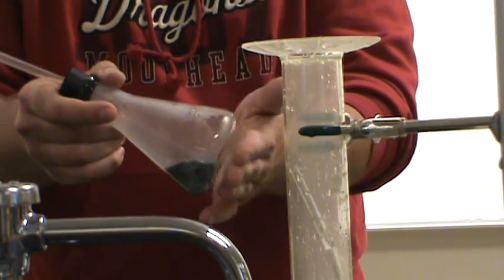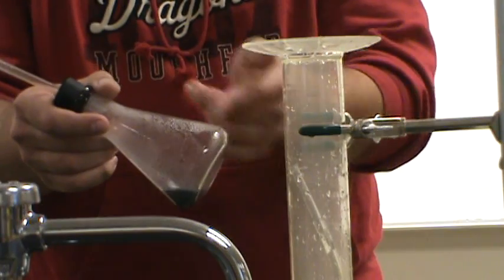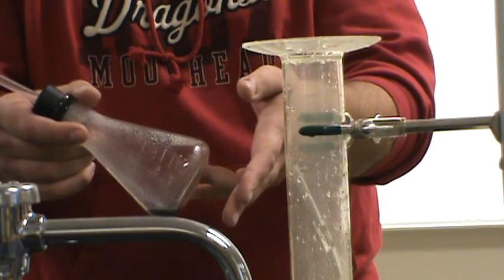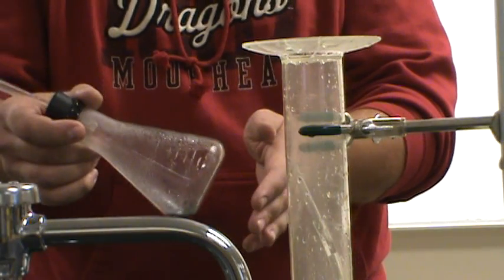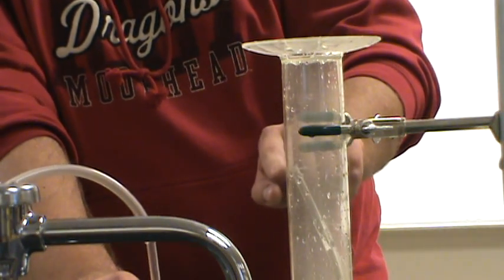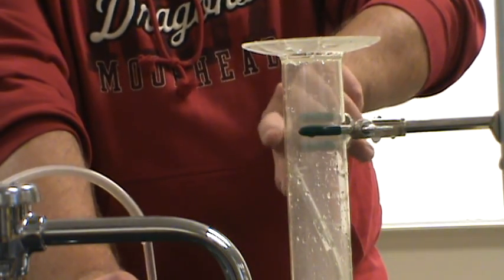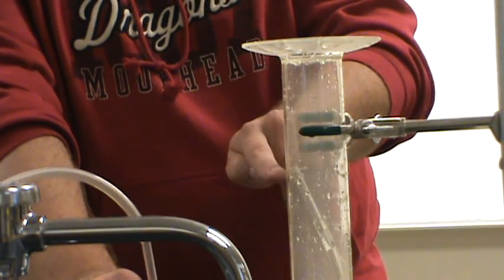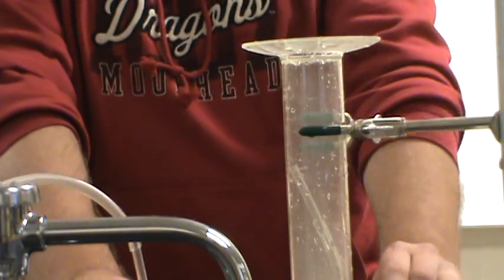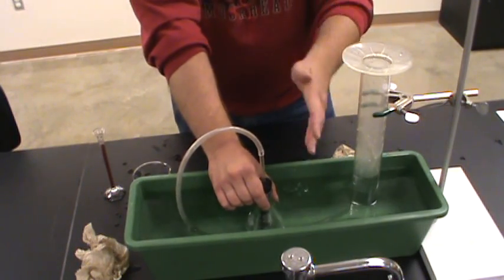One thing you'll also notice is this flask is starting to get kind of warm. This reaction generates heat as well as gas. But to measure the volume of a gas, I need it at a relatively constant temperature, so I'm going to use the temperature of the water in my trough as a temperature bath. Let me dunk this in the trough to cool it down while the reaction continues. It's very important that the tip of your gas collection tube is above the level of liquid in here, because as this gas cools down it'll contract, and if that gas tube is under water, it's going to suck water in. Right now it's just sucking extra gas in as the temperature equalizes.